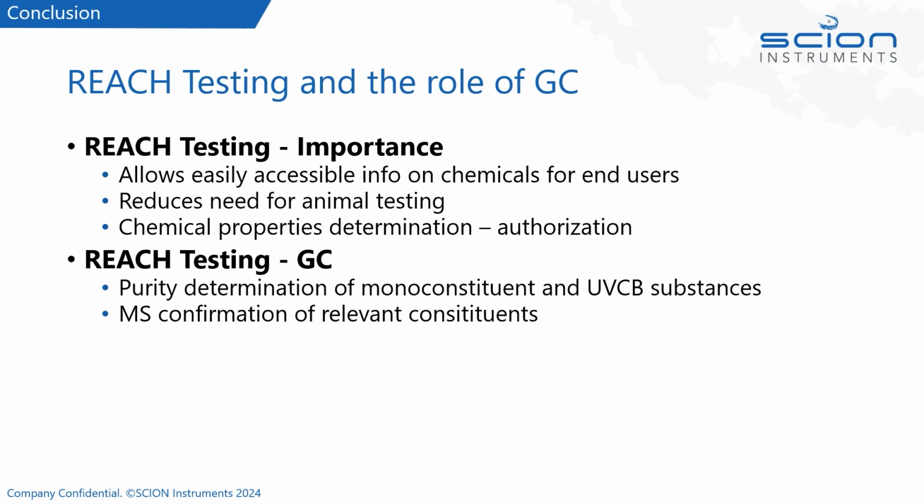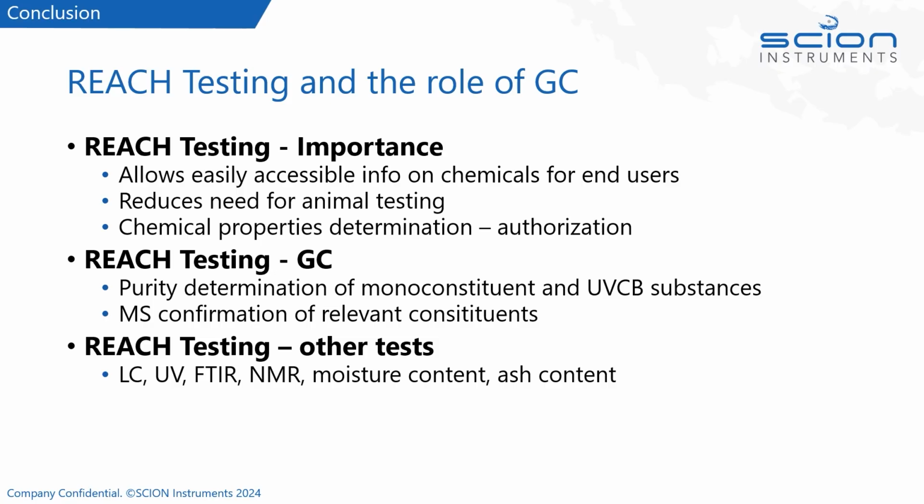There are other considerations for REACH testing. There is a requirement for other tests. For example, for purity, GC may not be suitable, so we may be able to use LC. There's also a requirement for further spectral data, so UV, FTIR, NMR, and there may well be a requirement for things such as moisture content and ash content as well. So all things to be aware of in the extensive requirement for substance identification.